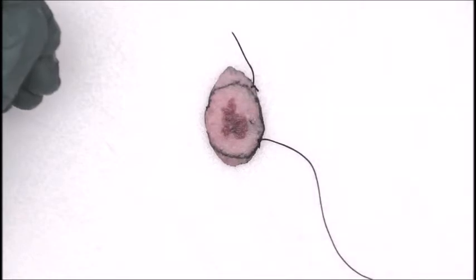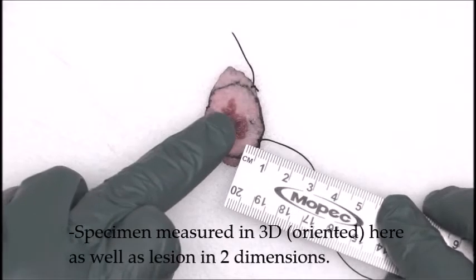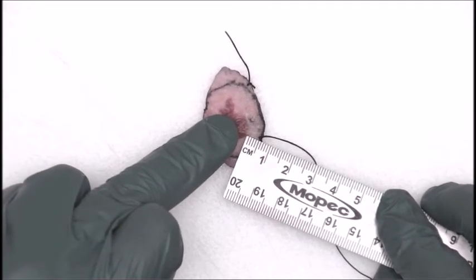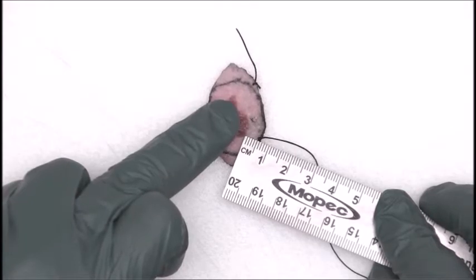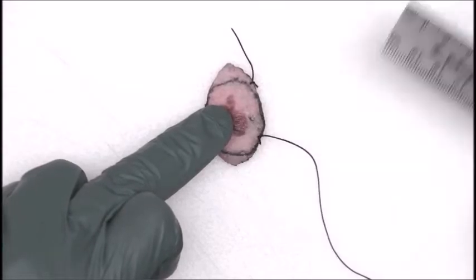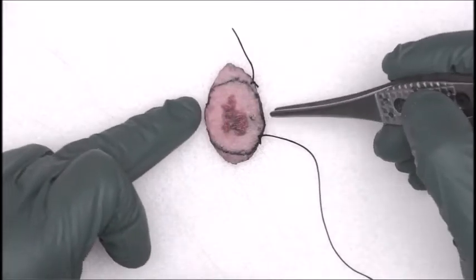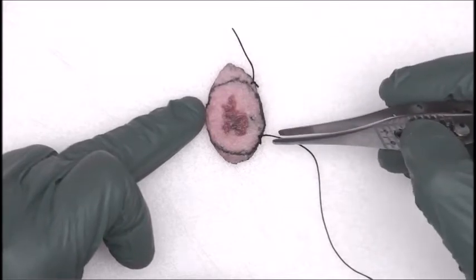I want you to take note of the lesion, the border of the lesion, and the measurement of the lesion to the peripheral skin soft tissue margin. It's about 5 millimeters or 0.5 cm. Depending on the depth of the melanoma, sometimes they will do a much bigger excision with more margin to it. So I'm going to go over the clock face and how we designate these sutures per clock face in just a second.